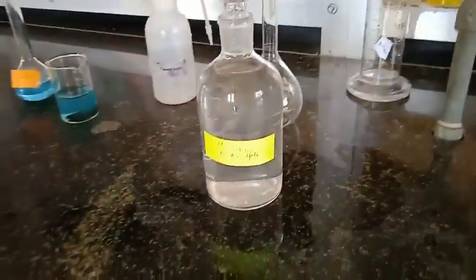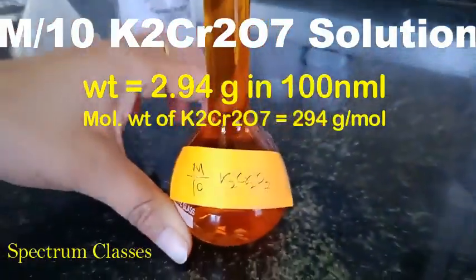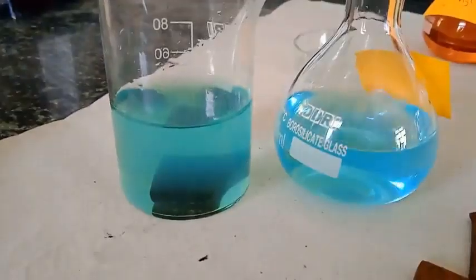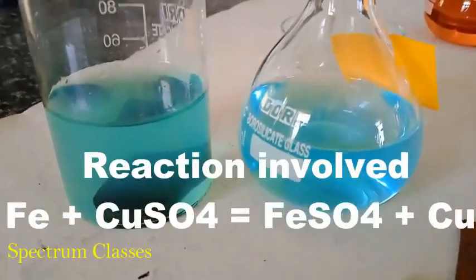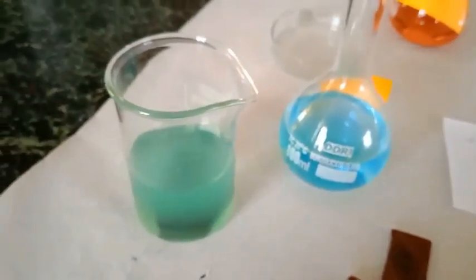Now to standardize this sodium thiosulfate solution, I am going to prepare M/10 K2Cr2O7 solution. Meanwhile, you can see the reaction of iron strip and copper sulfate solution. So this is half an hour.